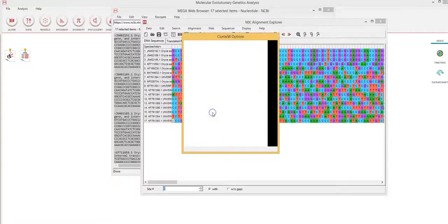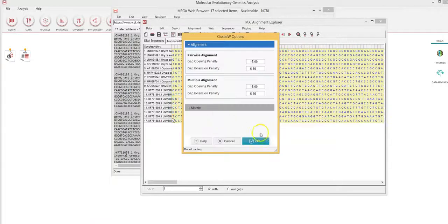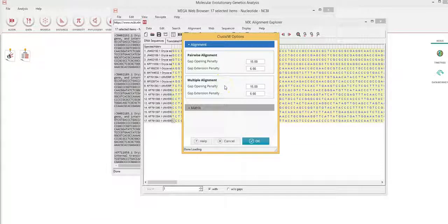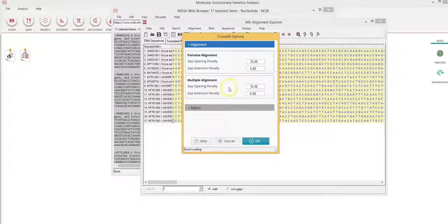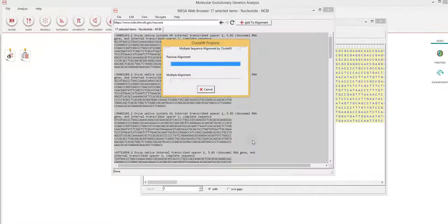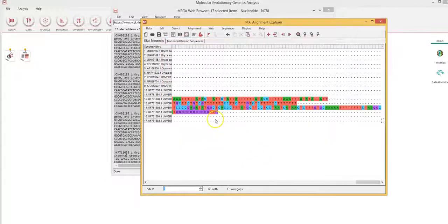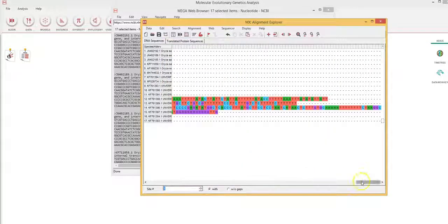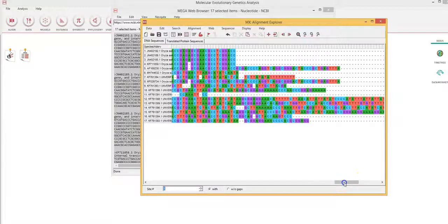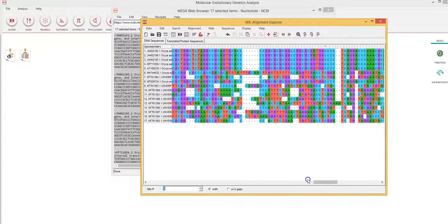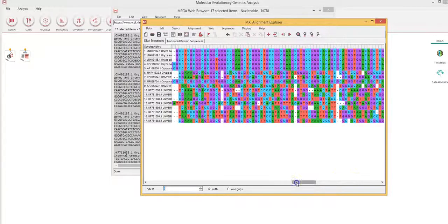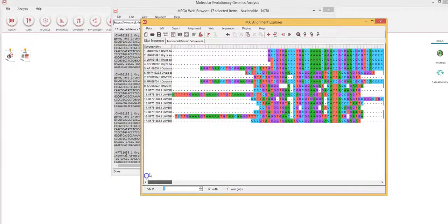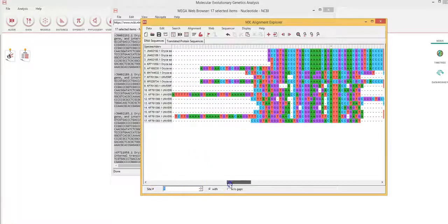So I select all and my default parameters for the gap penalty for pairwise and multiple alignment have been set at default. And I click okay. Now the sequences will be aligned and the speed at which these sequences align will be determined by your processor speed.